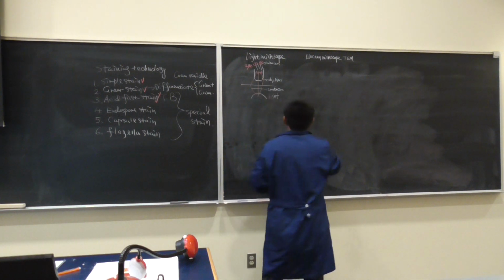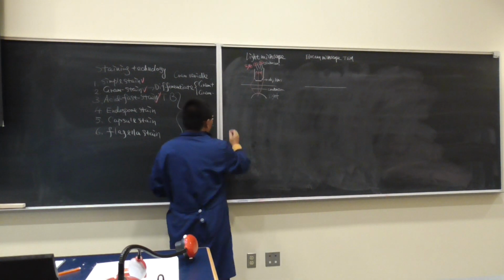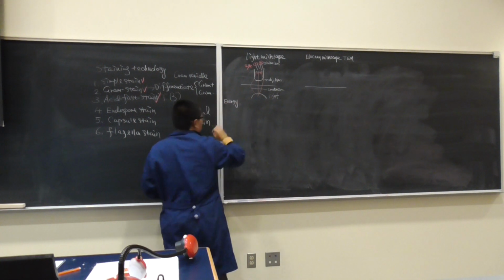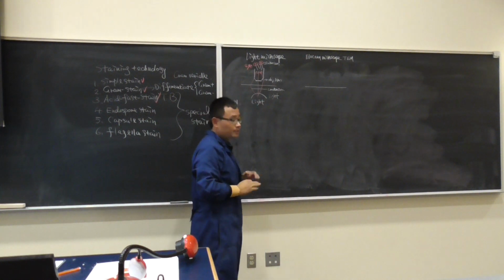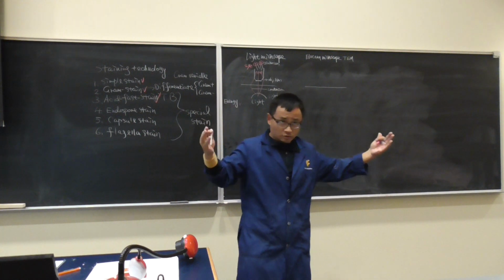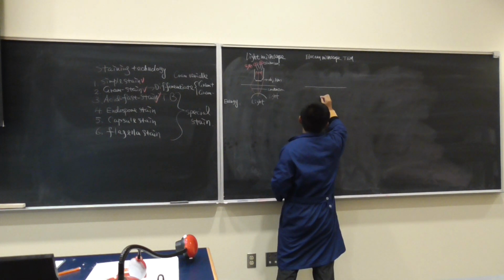Okay, now, what does the electron microscope look like? First thing first, the energy source. Light microscope, the energy source is light. I said, plug in, turn it on, all the way to the bottom, which means the light is the biggest one. Electron microscope, it is something not light. Something like bullets, like a gun.